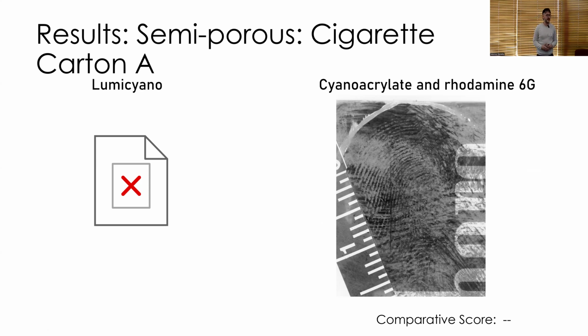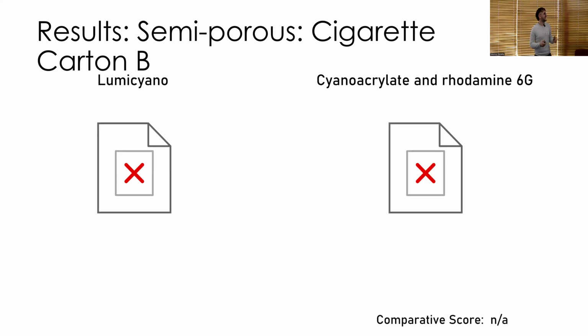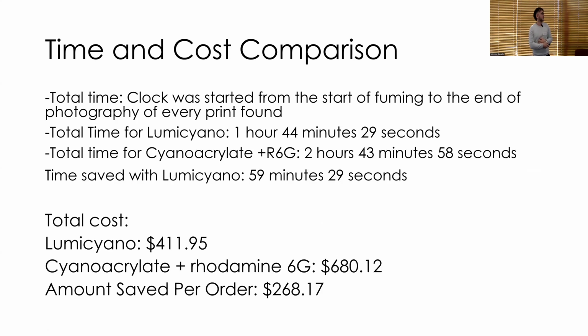Me and Amanda, my internship coordinator, agreed that this was definitely a workable print, not great, but definitely could use some enhancement. Maybe we could use it. So this is in between that 2 and 3 range. But again, because Lumicyano yielded no result, we're going to give it to cyanoacrylate. And I think you guys know where this is going. Neither technique yielded a result for our second cigarette carton, so that's not really adequate.